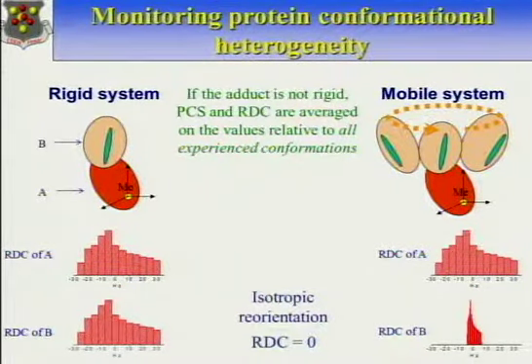And because we know that the protein is jumping from one configuration to the other, where the domains are moving one with respect to the other, what we produce are ensembles that contain 10 to 50 different configurations, which on average satisfy the distribution of data that we obtain.